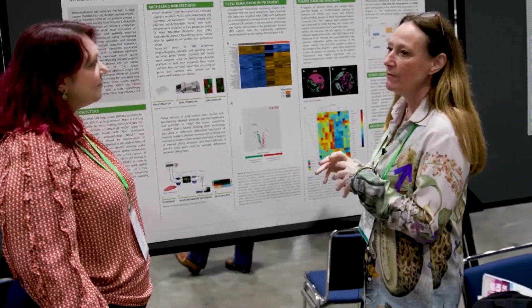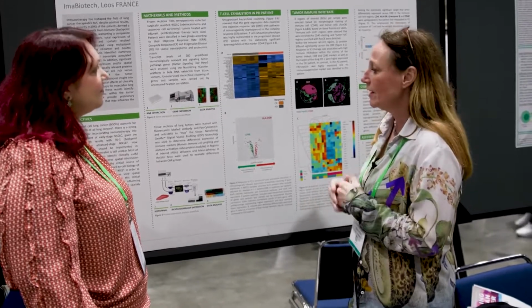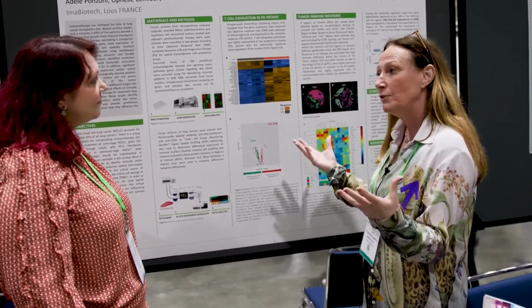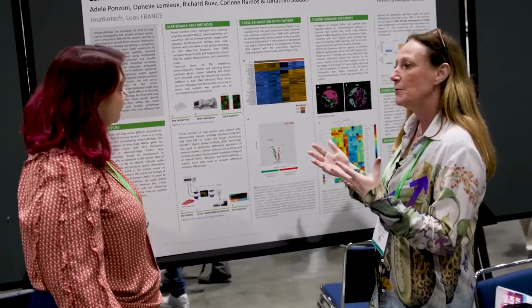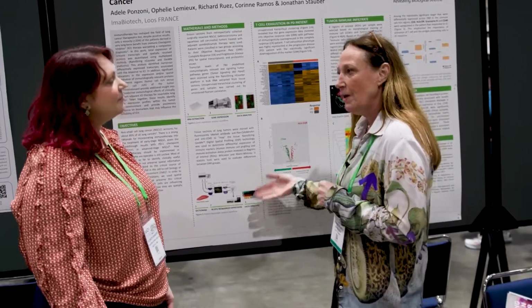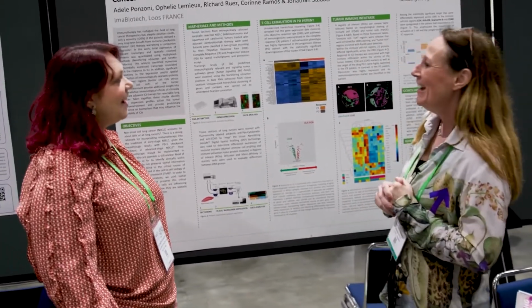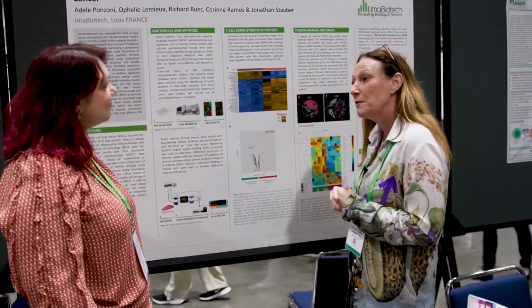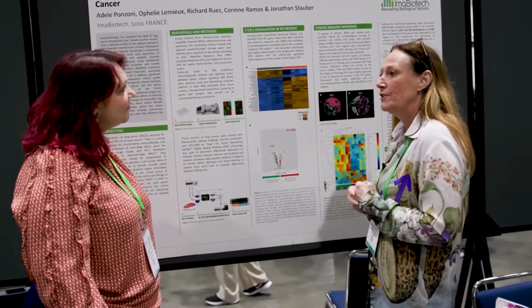Actually, I just wanted to have an unbiased way of looking at the gene regulation. So that's why we used nCounter first to get an idea, in the bulk, of what would be the upregulation of genes. And after that, we used the GeoMx DSP platform, the digital spatial profiling platform, to look at more predictivity in terms of treatment response within a very specific region of interest on the tissue.